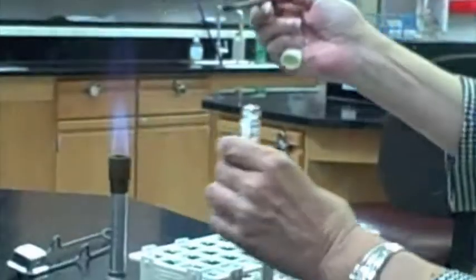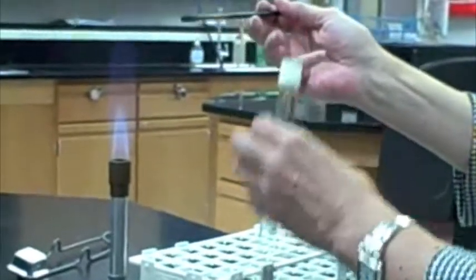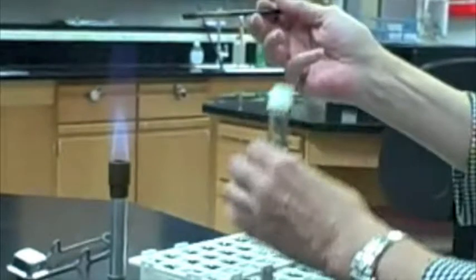Take care not to touch the sides of the tube. Keeping the loop in one hand, flame the top of the test tube and screw the cover back on. Set this tube in the test tube rack.